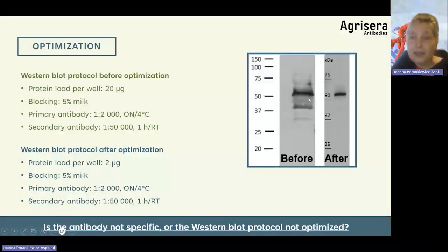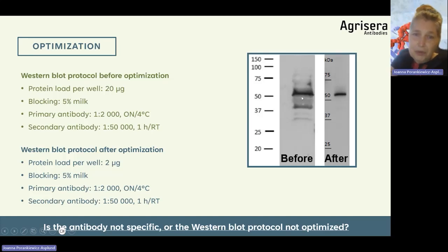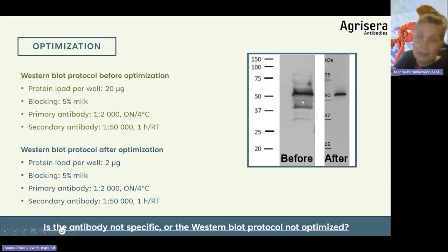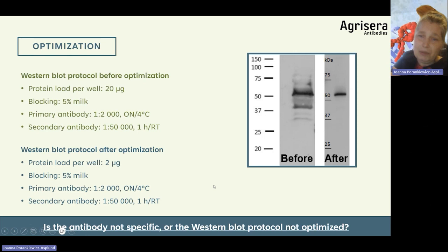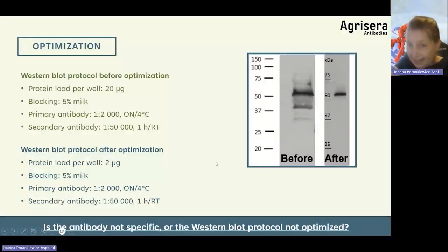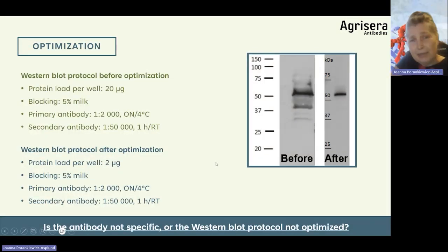So it is not that it is a bad antibody. It is actually a strong antibody which was used with too much protein loaded in the well. This is the optimization process, which sometimes can be that easy, and sometimes it may require a little bit more.